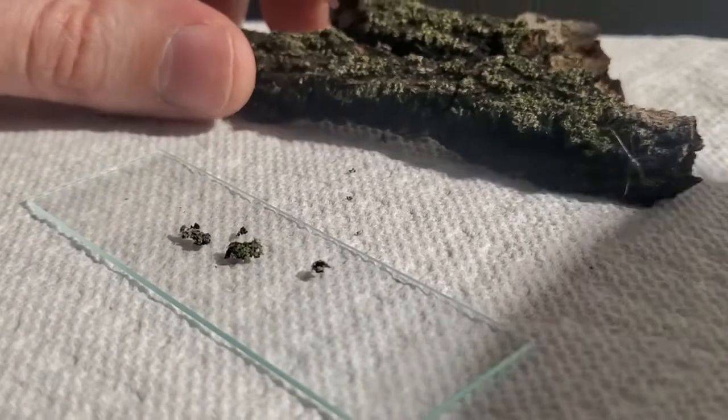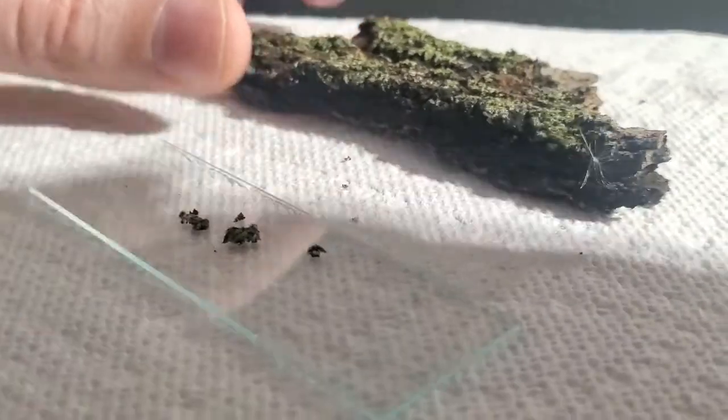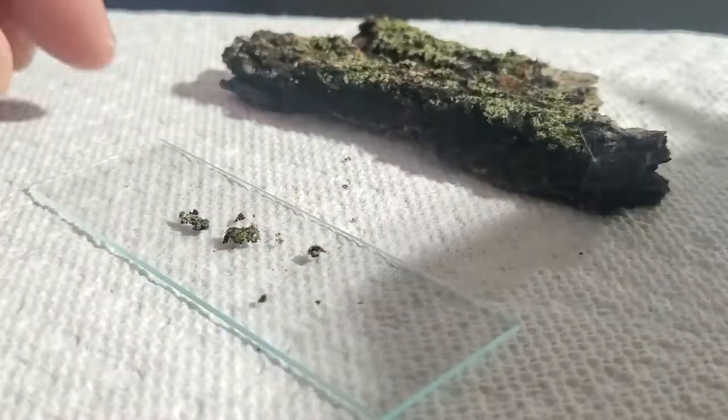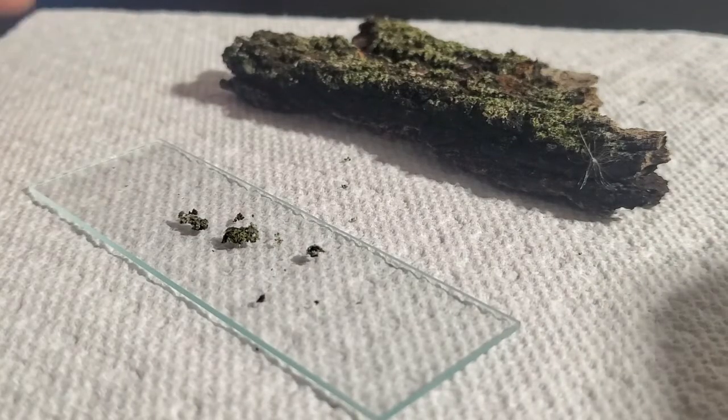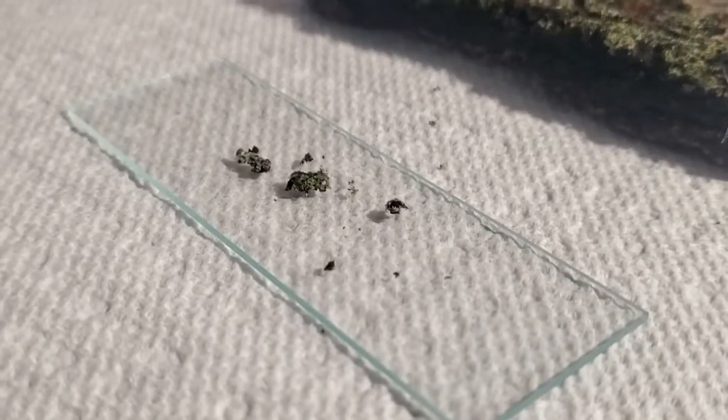Alright, what I'm doing here is I'm scraping a little bit of moss off of this tree bark and sprinkling it onto the slide so we can examine it at a high rate of zoom.